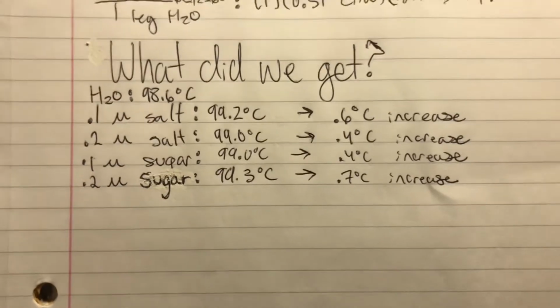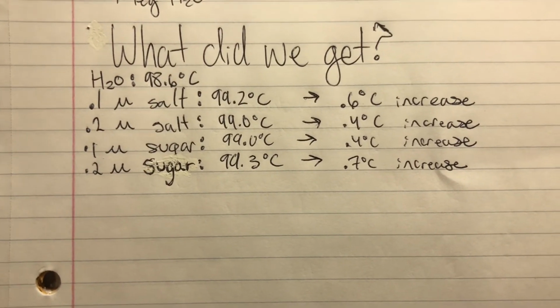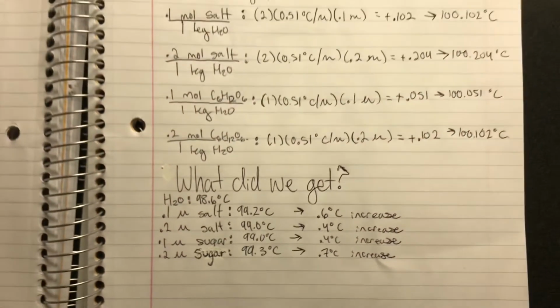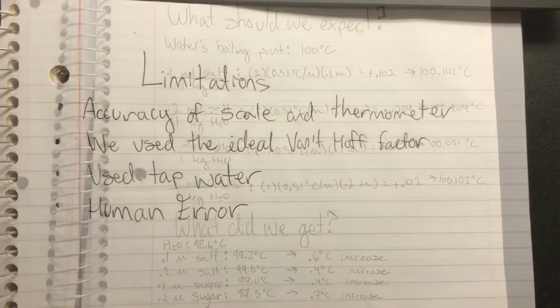With all experiments, our expected values are not going to match our actual values, and this is what we got. Quite a bit different from our expected values.